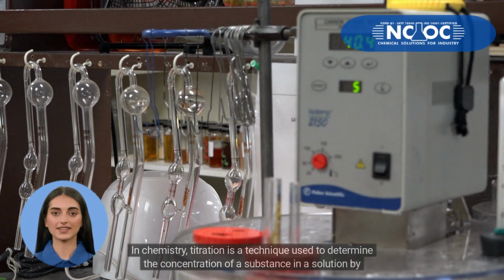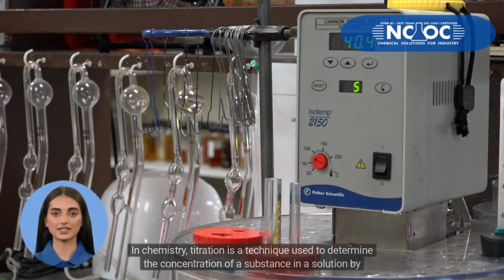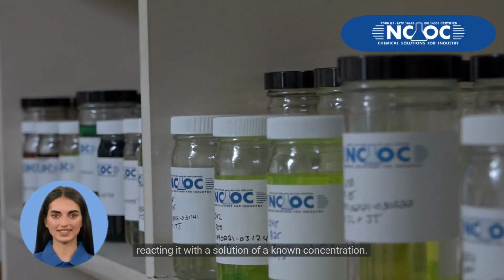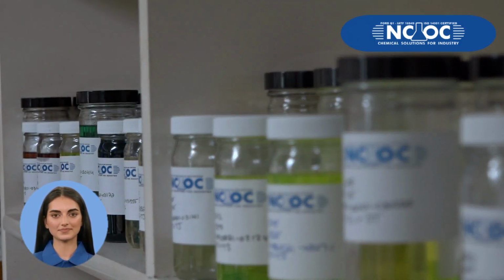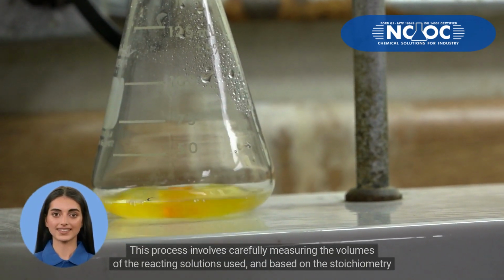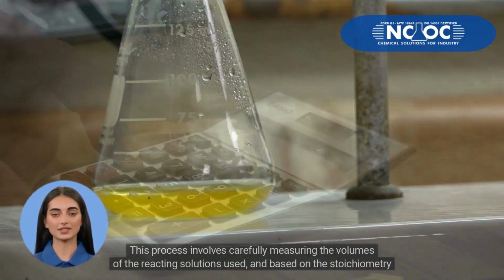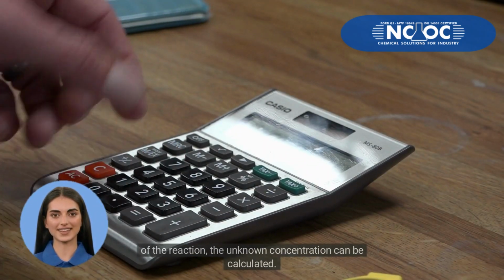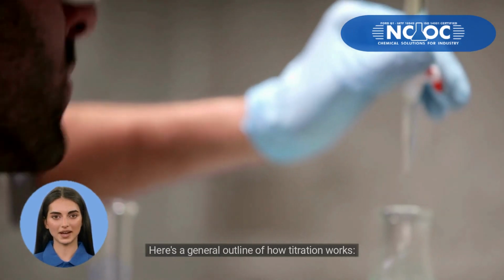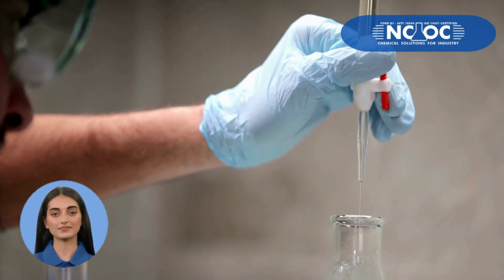In chemistry, titration is a technique used to determine the concentration of a substance in a solution by reacting it with a solution of a known concentration. This process involves carefully measuring the volumes of the reacting solutions used, and based on the stoichiometry of the reaction, the unknown concentration can be calculated.